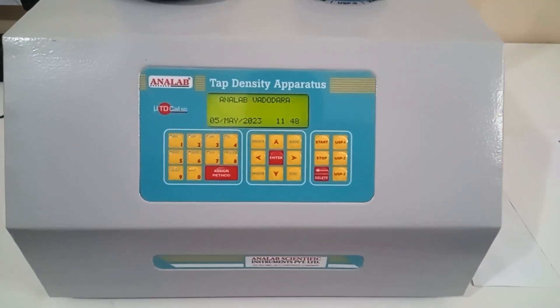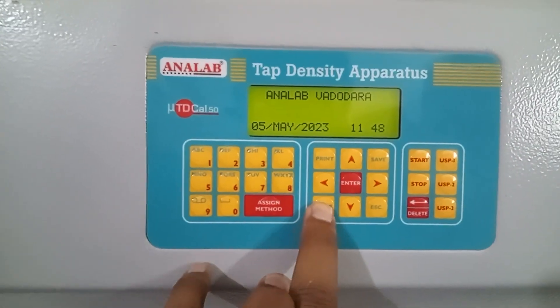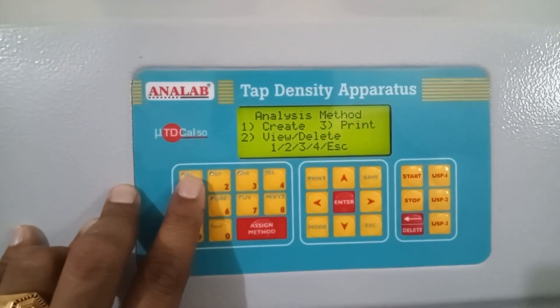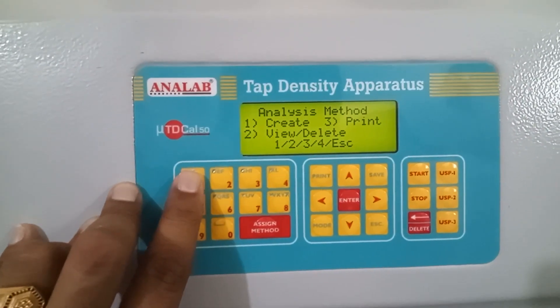So now we will start with creating a method. First, you need to go into the mode button, then you will need to select method. There are three different options: to create a method, print the methods which are already saved, or to view and delete them. We will create the method.